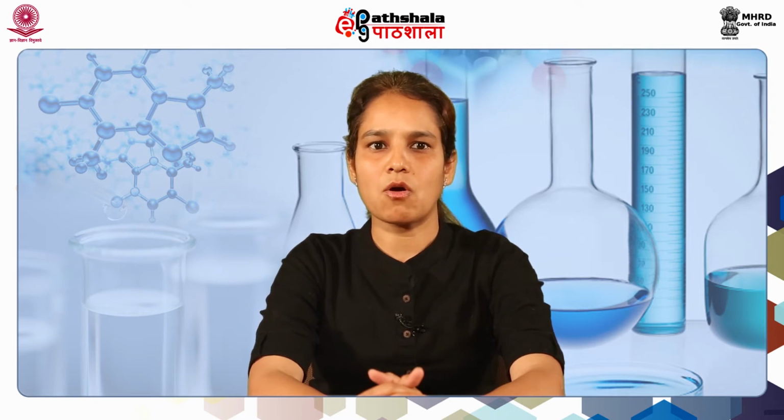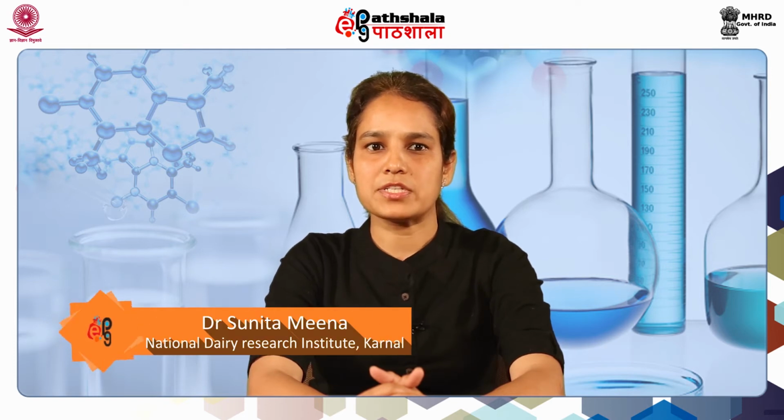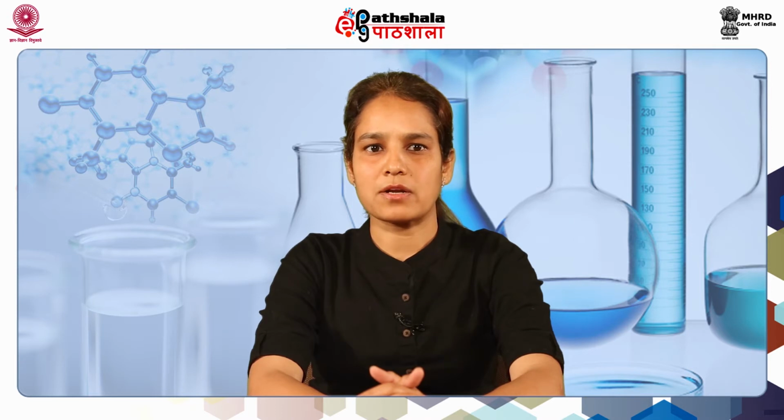Energy gap between bonding or non-bonding orbital and anti-bonding orbitals will depend on which bonding or non-bonding orbital electrons are excited to which anti-bonding orbitals. If matter is exposed to varying wavelength light, it will absorb light of defined wavelength, and a plot between absorbance and wavelength is called spectrum. Science dealing with determination of wavelength, which is maximally absorbed, is called spectroscopy. UV visible spectroscopy is widely used for identification and characterization of organic compounds.